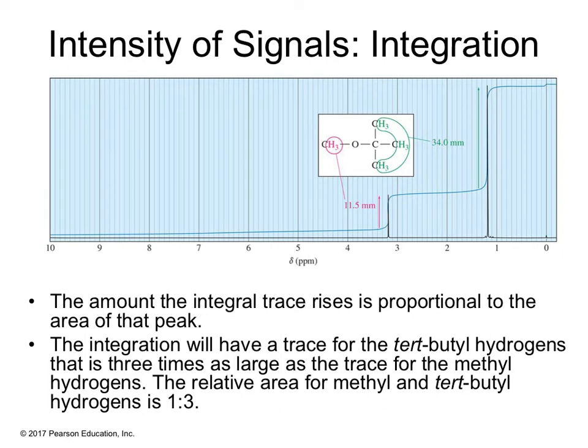Okay, so intensity of signals. This is the number of protons, hydrogens present. So here you have 3. Sometimes you get the computer and you set the value to 1 and then it'll integrate to nearly whole numbers. Sometimes you get just the millimeters high, and you would get a ruler, and you would say, well, this peak here corresponds to 3 hydrogens, so you would say 11.5, get out your calculator, divide by 3.